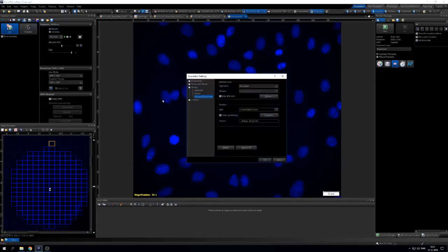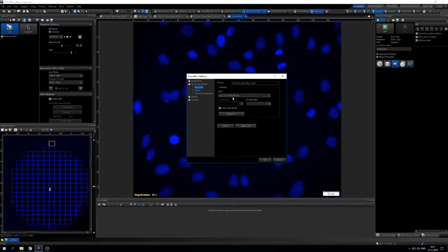This one is important, the acquisition setting. So you can go to the document name, name the snapshots. That is images taken in the camera icon in the top. And give it some meaningful name here. And here you can see it's counting. So it'll start from 1 to 3 and so on.